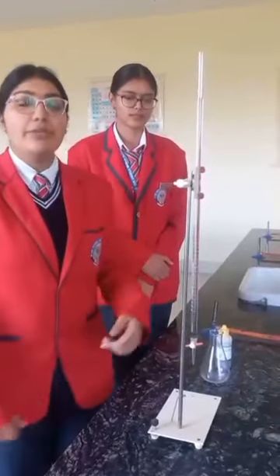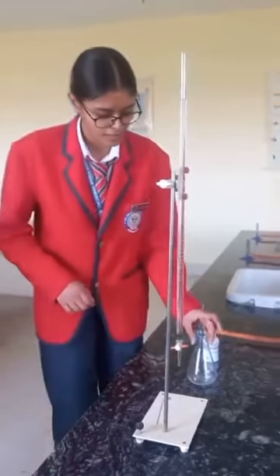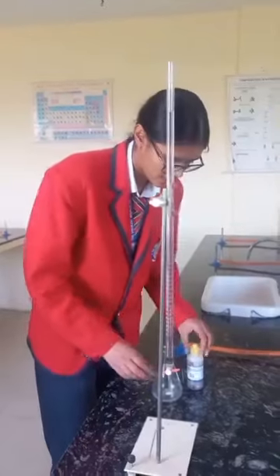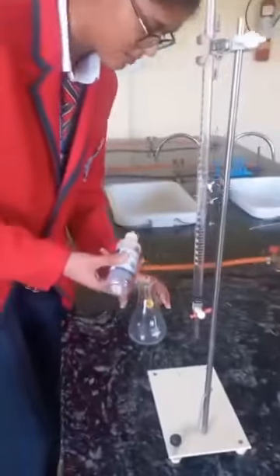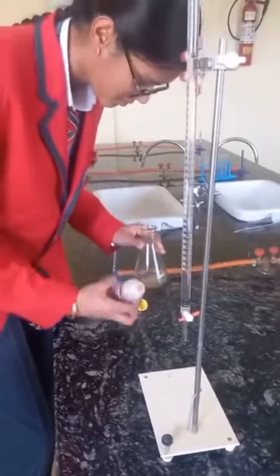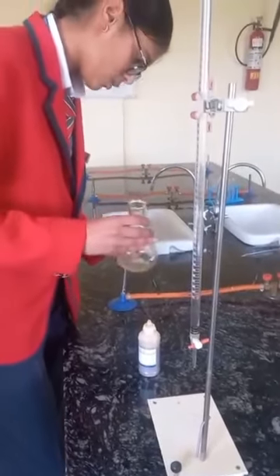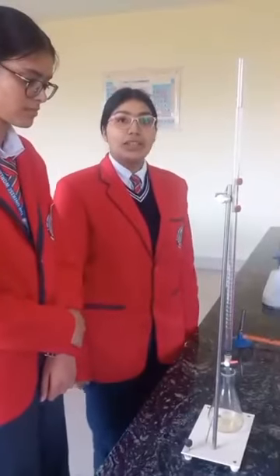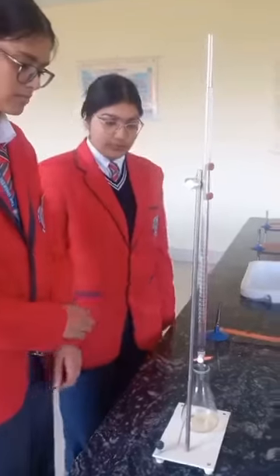This is a burette and we have taken dilute HCl in the burette. And we have taken M/20 solution of sodium carbonate in this flask, and now we will add 2 to 3 drops of methyl orange. Now we can see the solution has become yellow. Now we will add drop by drop the HCl solution into the sodium carbonate solution.